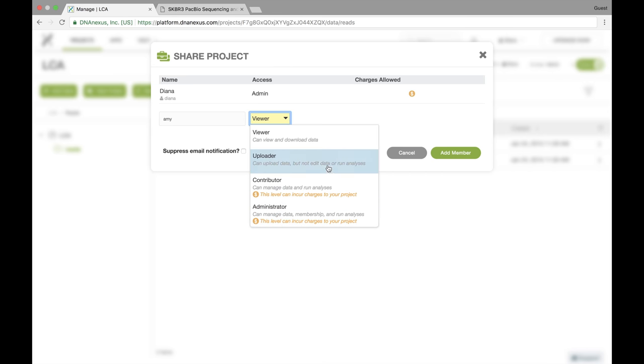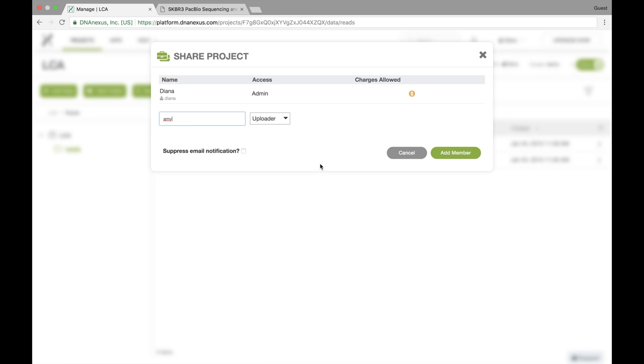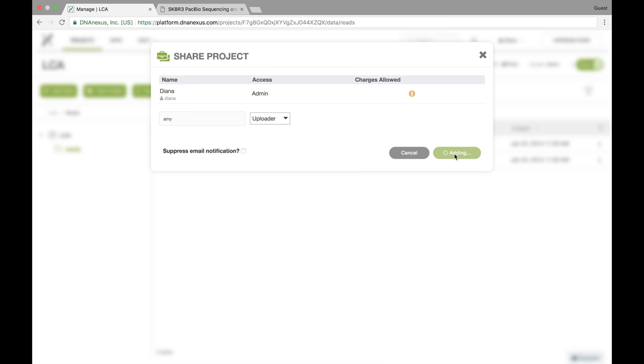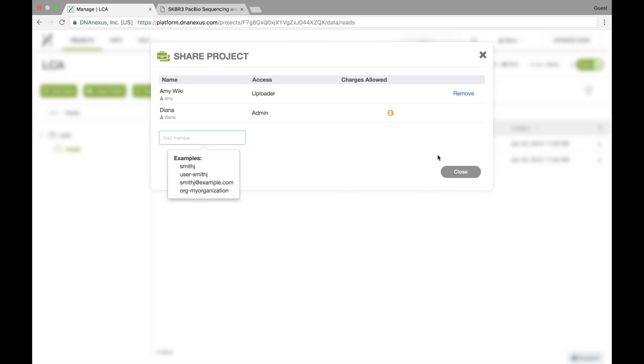So I'm just going to give her uploader access because Amy is working in the sequencing core and she's going to be putting data into this project, but she doesn't really need to be working with any of the data other than just uploading it. So I'm going to add Amy and here we can see that we have a list of the people who have different levels of access. So you can always manage that and I can remove Amy later if I don't like her anymore.